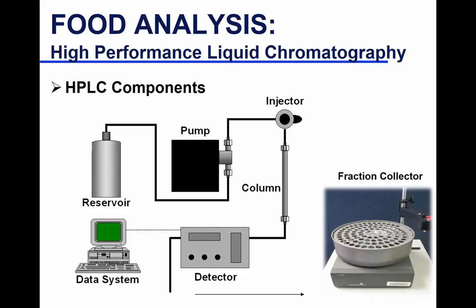And then for each reservoir, you have a pump linked to it. Sometimes you have two reservoirs and a mixing chamber before a pump. Sometimes you have two reservoirs, two pumps, and then a mixing chamber. So low pressure mixing versus high pressure mixing. High pressure mixing, I would say, is better for the consistency of the mobile phase.